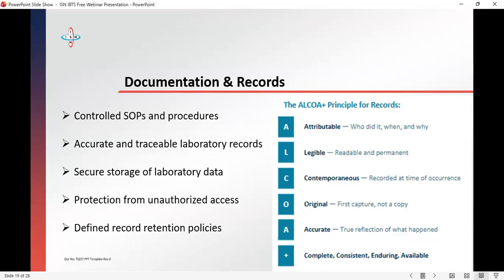Original copy, not photocopy. If for any reason the requisition form was carried and smudged with urine, put it in a file jacket, photocopy it, and document on it that the original copy was soiled with serum and had to be photocopied, because the original copy is always desirable, and you must never rewrite a form, because many a time you may miss information and the doctor will say, this is not what I sent to you.